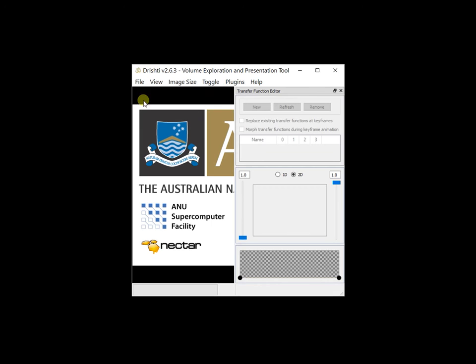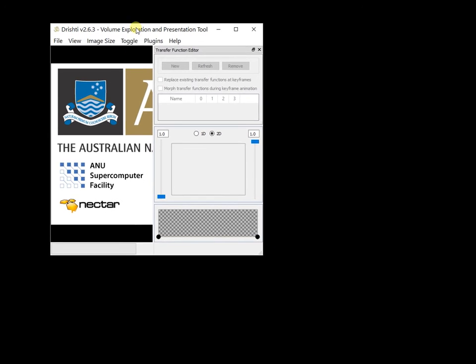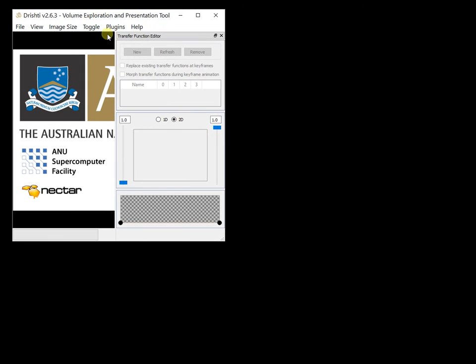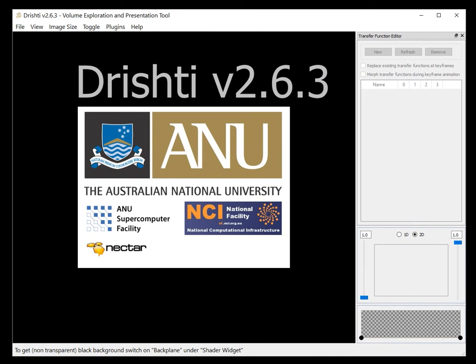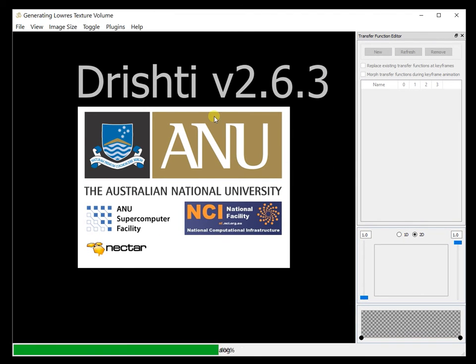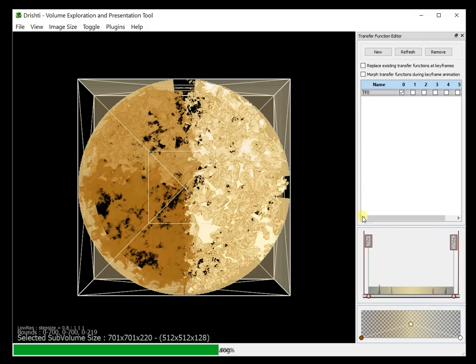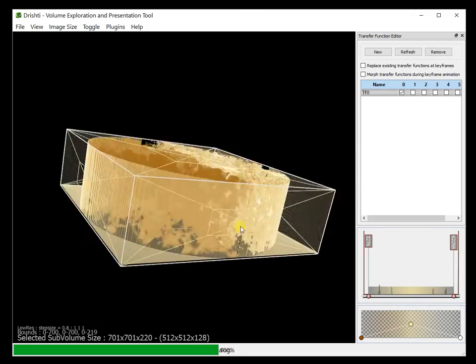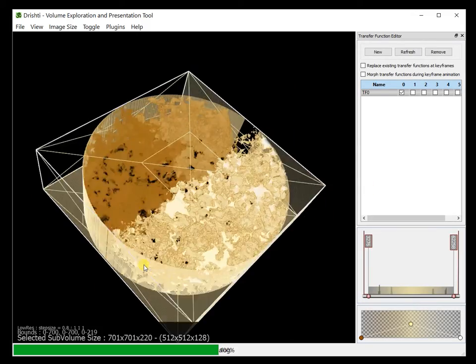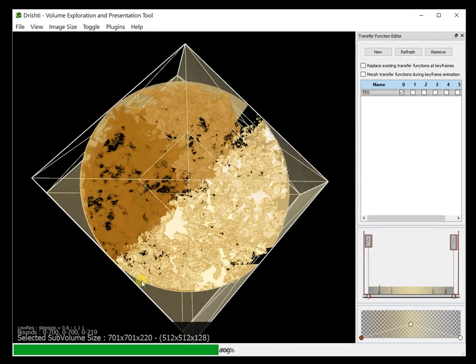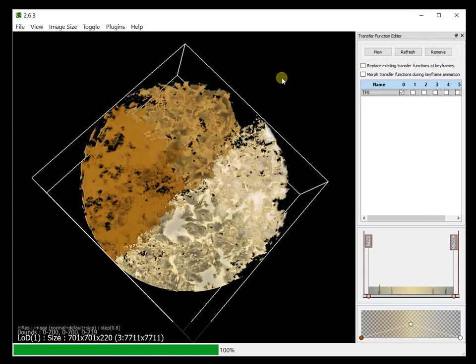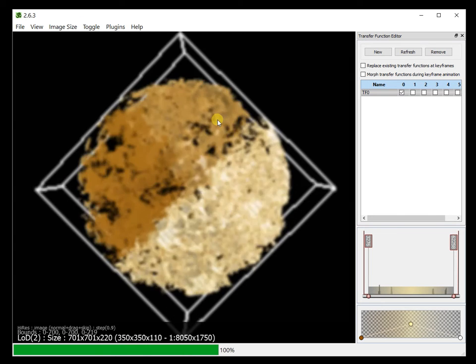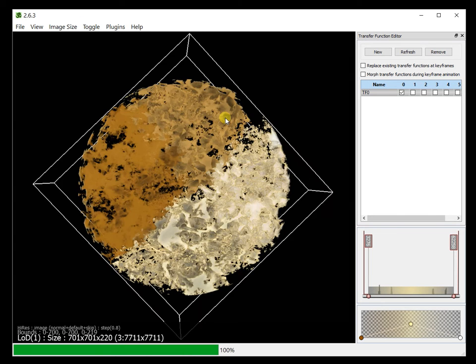So what we will be seeing are the pores, the segmented pores. So let's drag and drop the data. So this is what it looks like. Press F2 and you get this here.